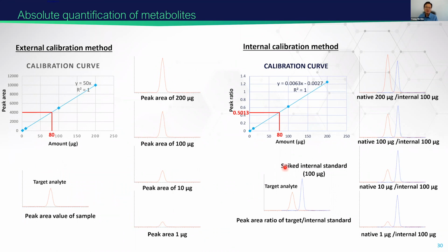However, intracellular metabolites are a little bit challenging for generating the concentration. So I prefer to use the cell dry weight. That is the most preferred method. So we can calculate how much metabolite there is based on the dry weight of the biomass. That's how we generate the metabolomics data, especially for absolute quantification.